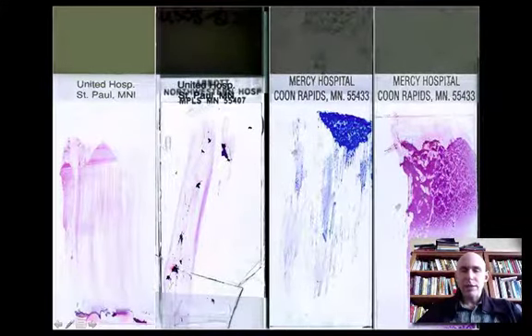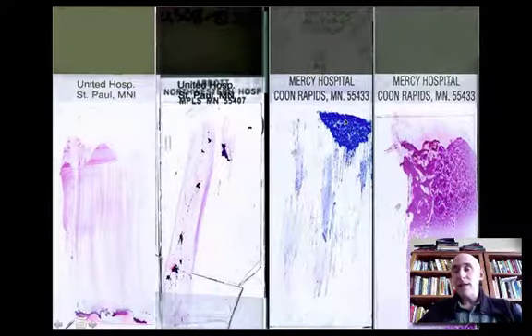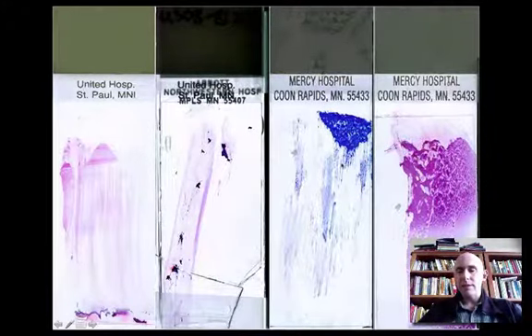This one actually has Scotch tape holding it together. You can use too much material, and I think that's one of the most common flaws, so that the two slides on the right-hand side of this panel are really too much material, too heavily glopped on into different areas.